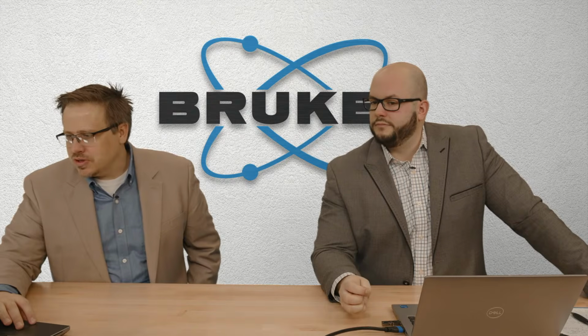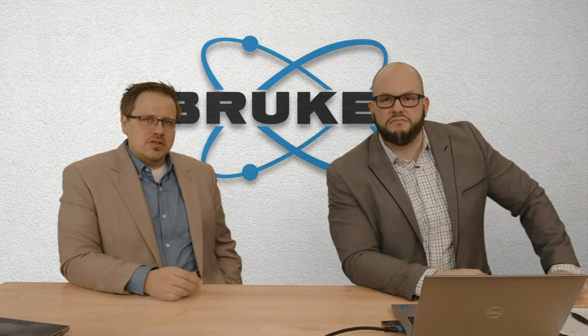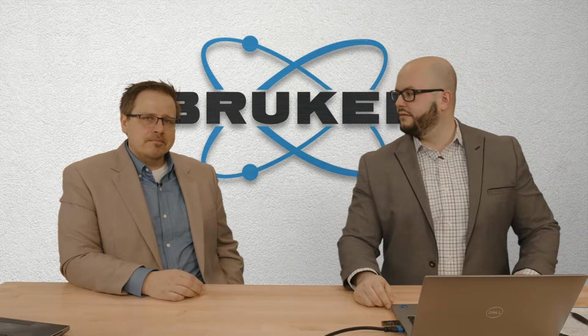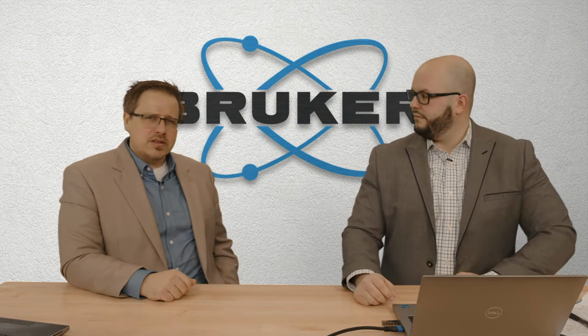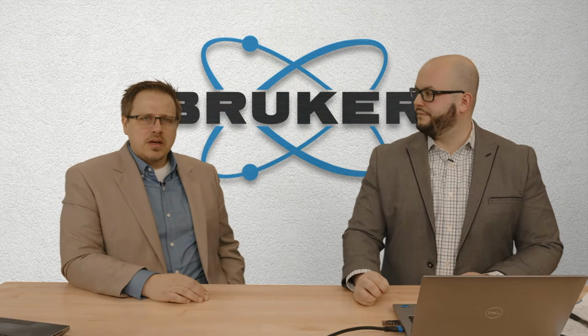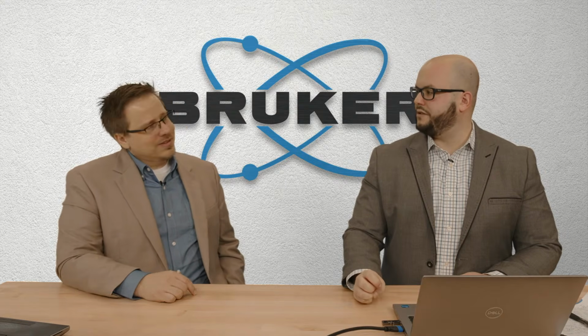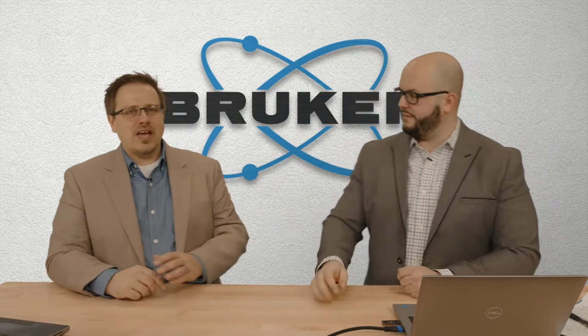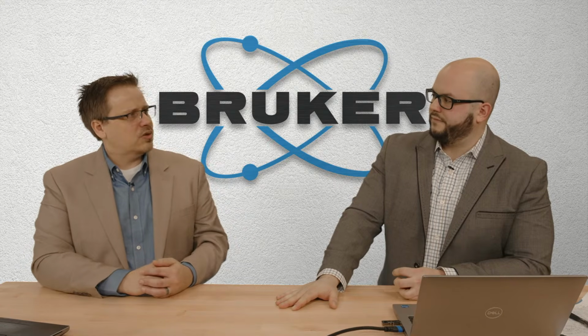Can you suggest suppliers who supply stress-free iron powder? Unfortunately not. I mean, the stuff I've used, I think, was from Sigma. Alpha Aesar, or Alfa. Yeah, something like that. Yeah. Like 6 to 10 microns, something like that. Yep. Look for a nice, smaller micron size. There's always the question, but generally I think they're made by a thermal spray process, so they're stress free. But yeah, if they're cooled too rapidly, something like this, you could have a problem. Like gas atomization or something. Yeah. I mean, if it's quenched, I could imagine it would change lattice parameter. But when I've done it with those powders, it's been pretty good. I'm not aware of anybody who does a certified one though.